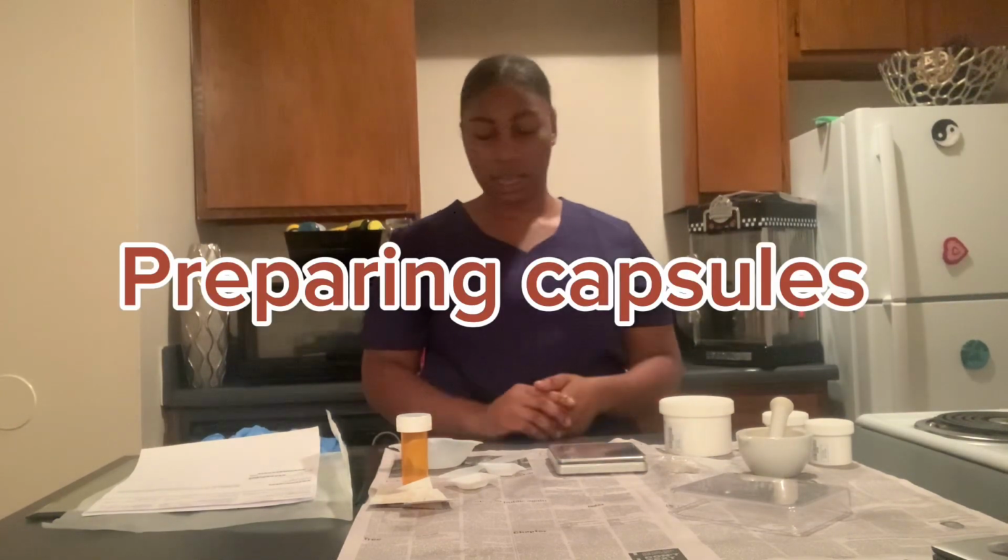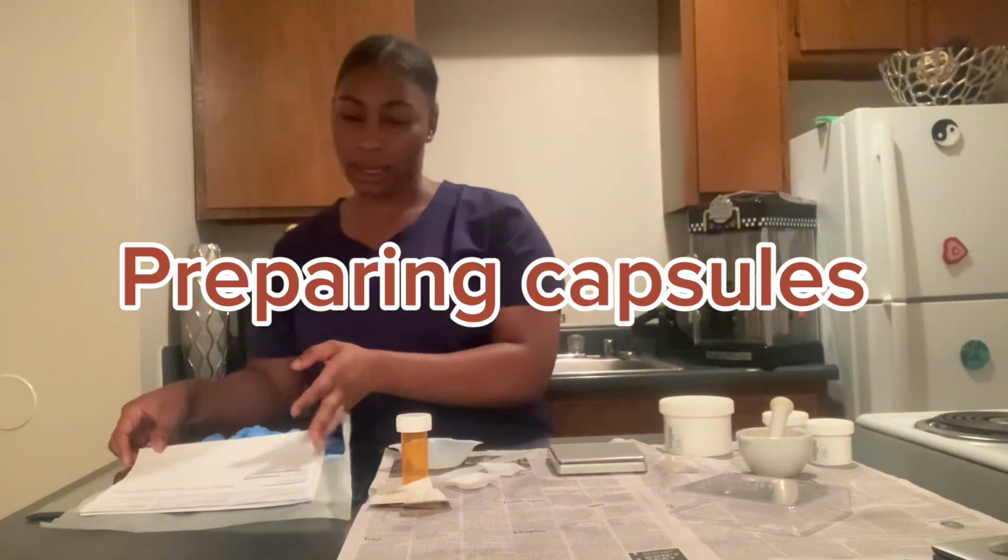Hi, my name is Kiesha Smith, and today we're going to be doing skill set 8, which is preparing capsules. So let's begin. Today for our prescription that we are preparing for a patient, their name is Samuel Urban. First name Samuel, and last name is Urban.